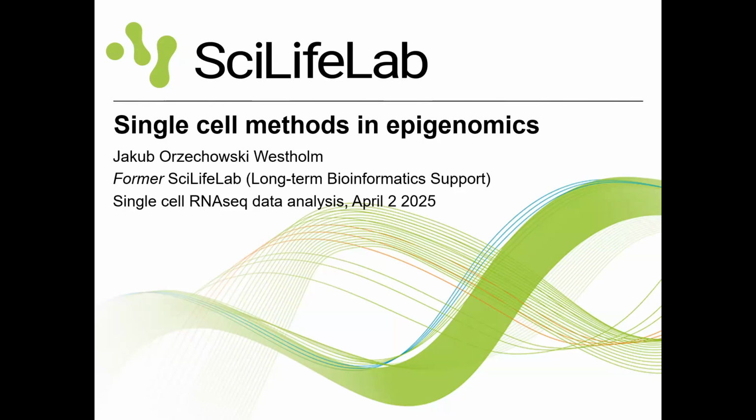I think a general thing we should say about ATAC-seq data is that we need enough cells to detect different clusters. We need enough cells to do differential expression for single cell RNA-seq. And whatever you're trying to do there, you probably have to have 5 times as many cells for ATAC-seq analysis to have stable signals. That makes it even more expensive to do ATAC-seq. You need more cells, because it's super sparse.